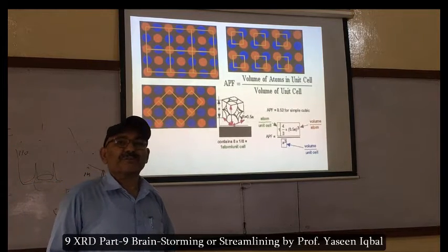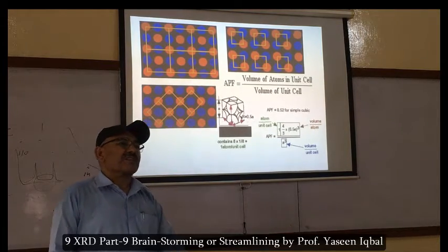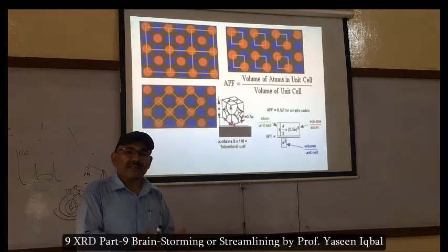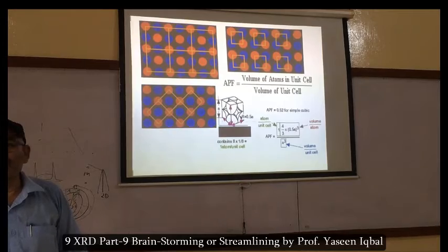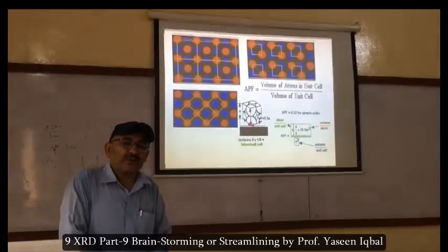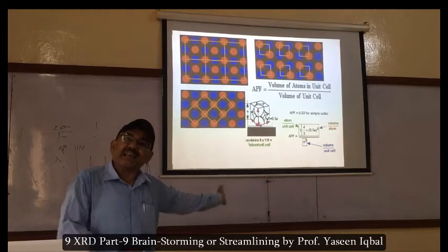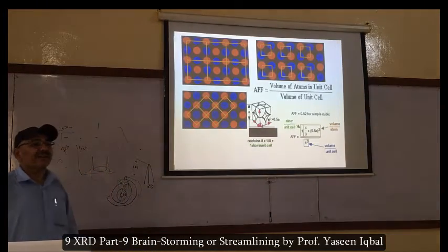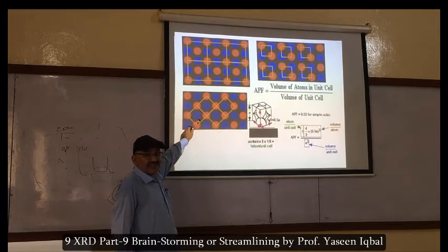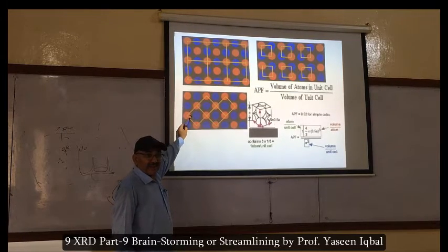The lattice parameters a, b, c, which people call for certain materials. They are not from the Torah or any other book. People have measured them. So they call the unit cell this or that, and according to that, they measure a, b, c. But if instead of that, your choice is this, this is another smaller cell, right?